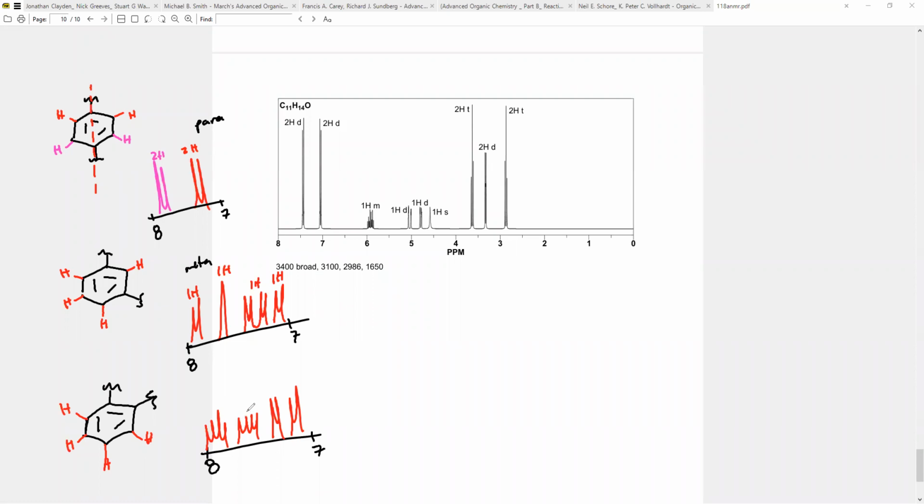We don't really see any singlets, or any nice indicator like the 2H or the singlet. So we default to ortho. In that case, we call this ortho. Okay, so again, just thinking about ways to rationalize what these groups look like.